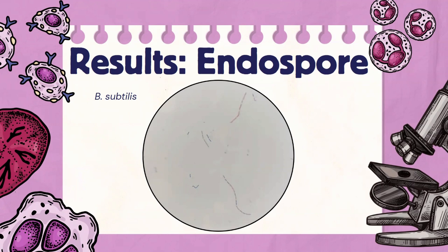The purpose of that steam fixing, though, is to drive the malachite green into the tough spore coat of these endospores. Without the steam, the dye wouldn't penetrate, and endospores would remain unstained or faint, even though for us, we can really still see it. That's what would happen normally if we didn't steam it. But when we do steam it, the slide is counterstained with the safranin that highlights those vegetative cells in red, while the endospores appear that green-blue color that we can see here.